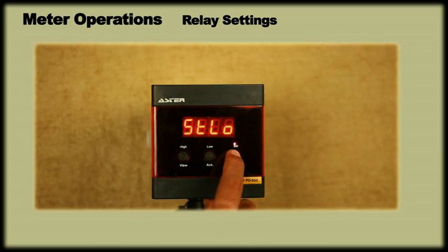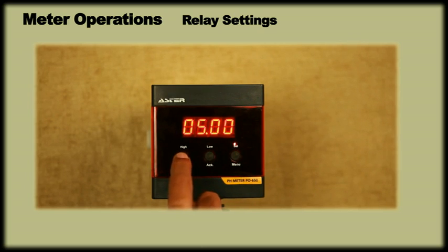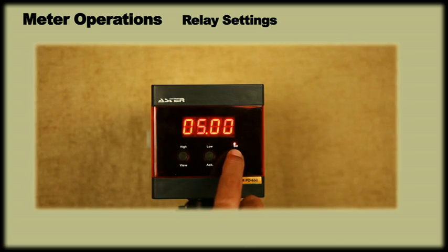Next, the display shows set low. By pressing menu, it will display a previously set low value. Using ACK key and view key, we can set the required low pH value. For example, let us set low pH value as 5 and press menu to enter. Always remember that low set point should always be lower than the high set point else the meter will show set error.